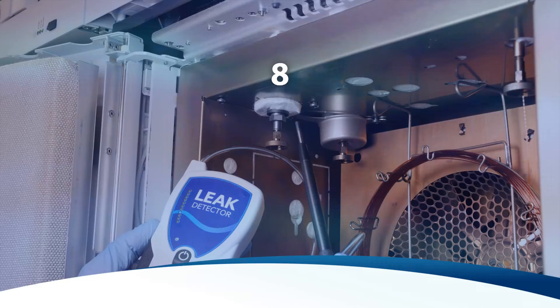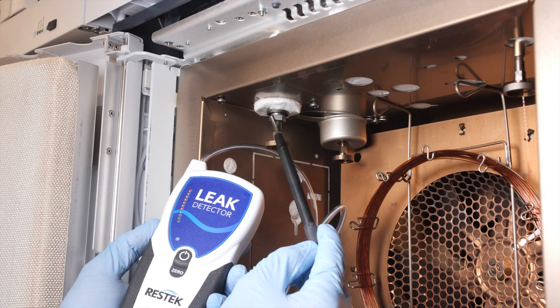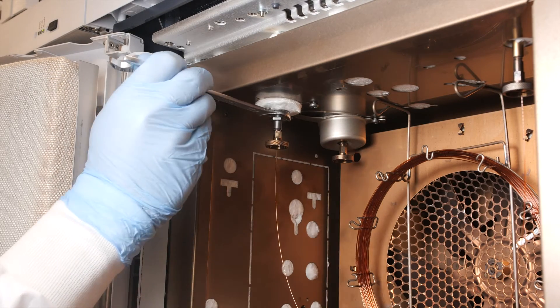The reducing nuts. Temperature cycling can loosen nuts if they are not properly tightened. If a leak is found, simply retighten the nut.